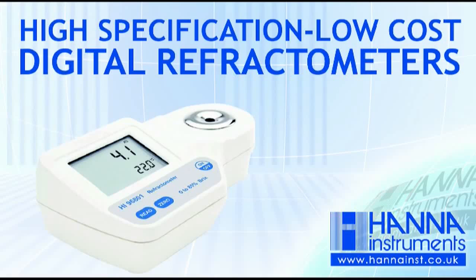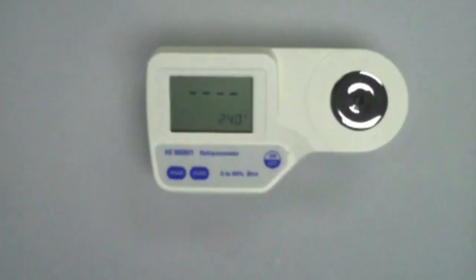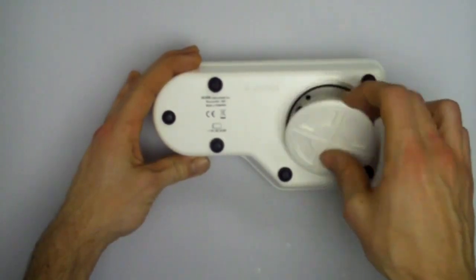HANA Refractometers offer excellent value with HANA's trademark high-specification, low-cost mix. Useful features include a dual-level LCD display, stainless steel sample well, and a waterproof battery compartment that is easy to open so no screwdrivers are required.